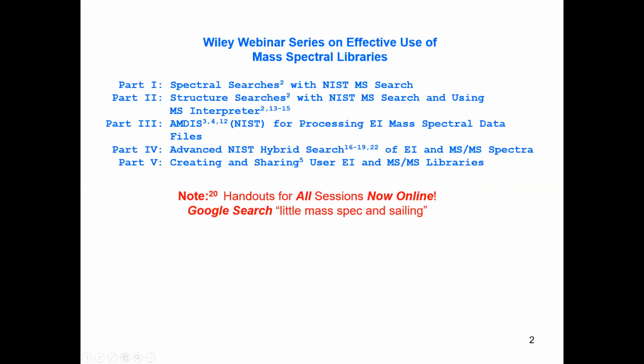I really need to stress the fact that to make this software work, all the NIST suites is great software, but you have to have all the settings done correctly. And if you don't, it will not work. So, and I don't want to bore you in the active demos. It just would take too long to walk through them. So I leave that as an exercise for you.